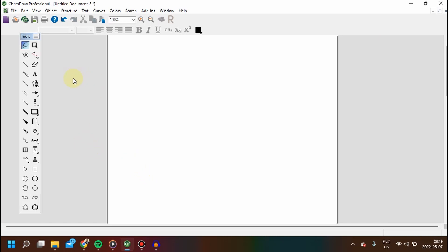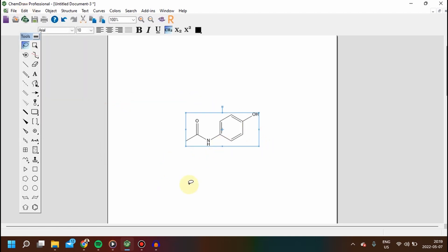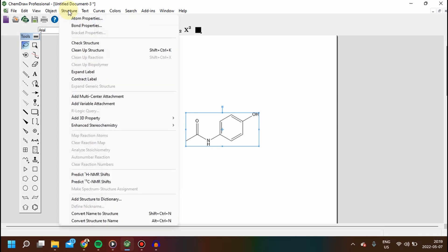To predict the NMR chemical shifts, we start by generating the structure. Select the structure and from the menu bar go to the Structure tab. There is a section for predict NMR chemical shifts that can be proton NMR or carbon NMR. Let's use proton NMR chemical shifts.